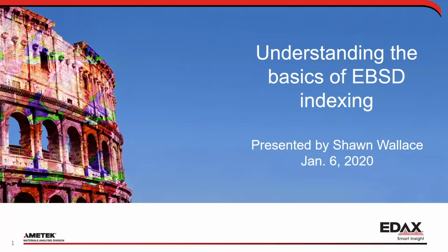So, comments on pattern quality. If you ever look at any EBSD literature, what you're usually going to see are these absolutely beautiful patterns, and I can show you pretty patterns all day. But these pretty patterns are not really needed for good EBSD indexing results. If you ever come to a training course, what I'm going to tell you over and over again is learn to trust the Hough Transform, because the Hough Transform is one of those things. When I got this job, I had to learn how to trust it myself.